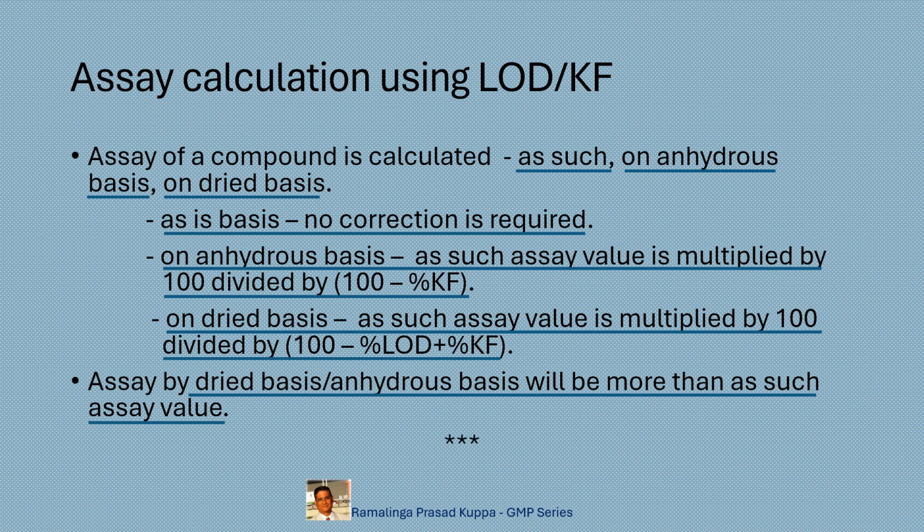I hope that the information on the comparison of LOD and KF tests is useful. These two tests look like giving the same or similar information, but there are obvious differences in both the tests. LOD and Karl Fischer values are used for calculating the assay value on 100% basis.